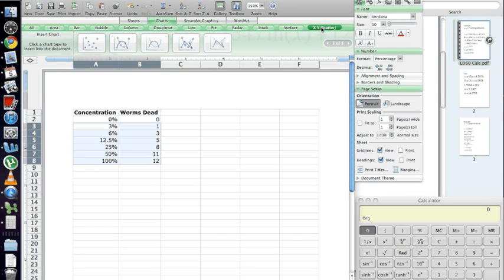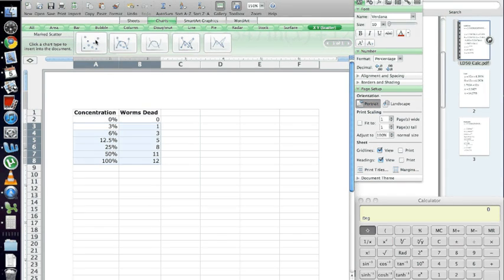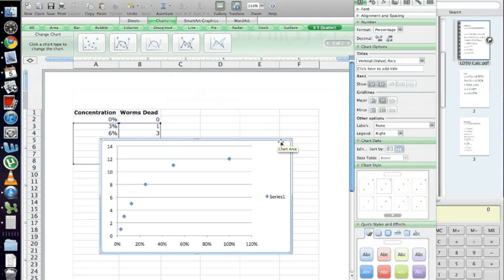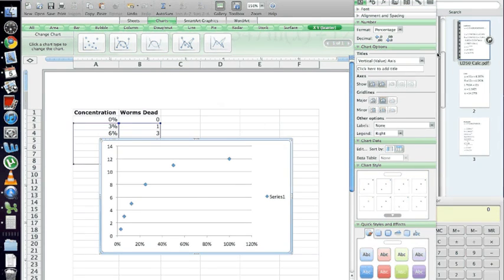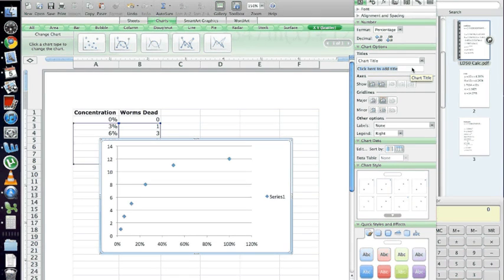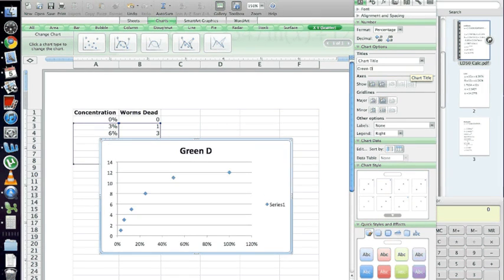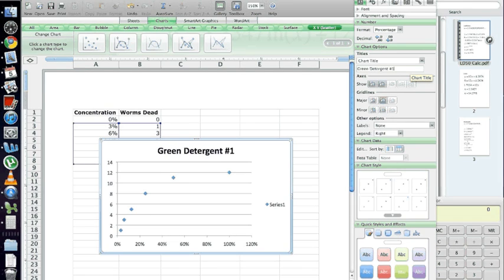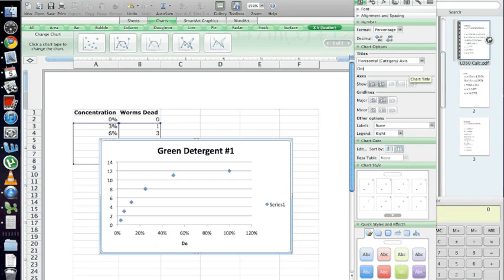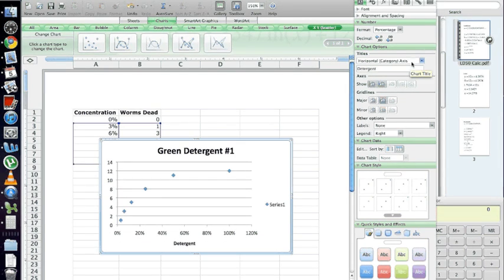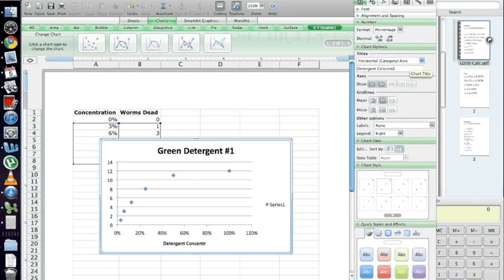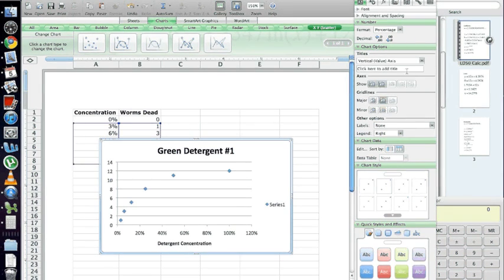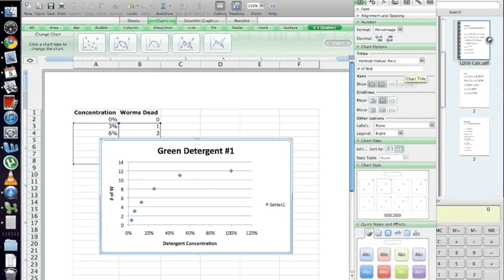Select an x-y scatter plot for your plot. Select this one right here, none of the ones with connecting lines, but just the scatter. Go ahead and label your graph. Make sure it's descriptive, something that when people read it, they'll understand what it is. On your x-axis, you're charting the detergent concentration. And on the y-axis, we have number of worms killed, or something like that, whatever you think is best.